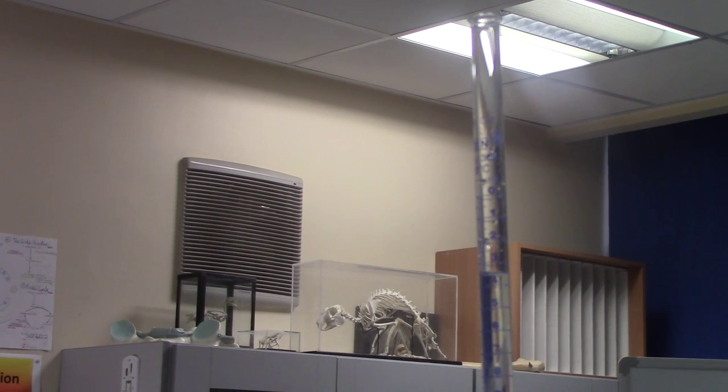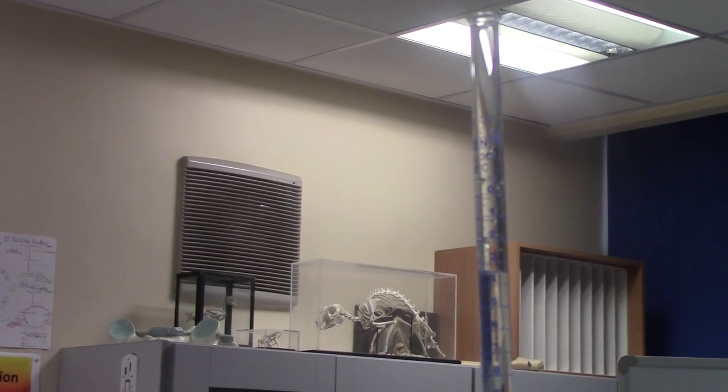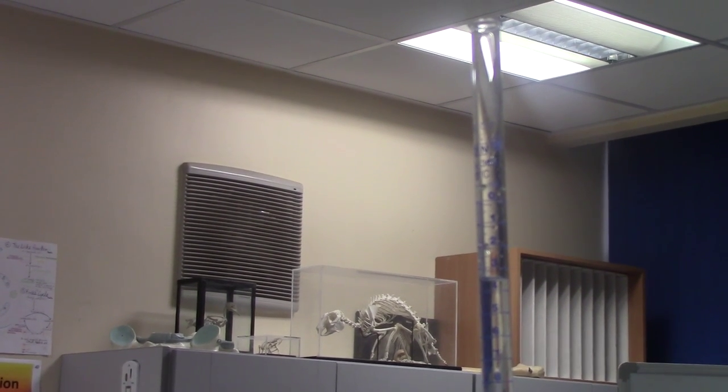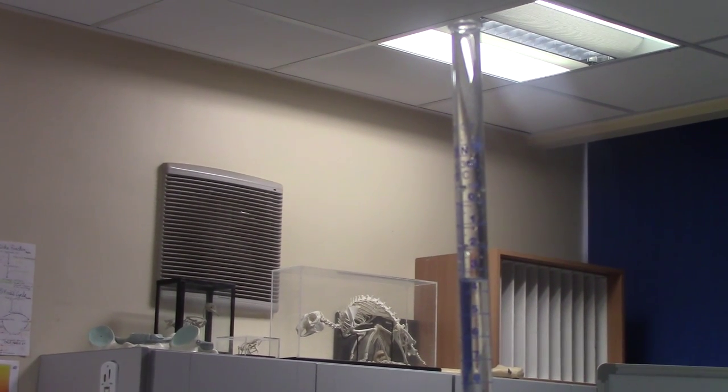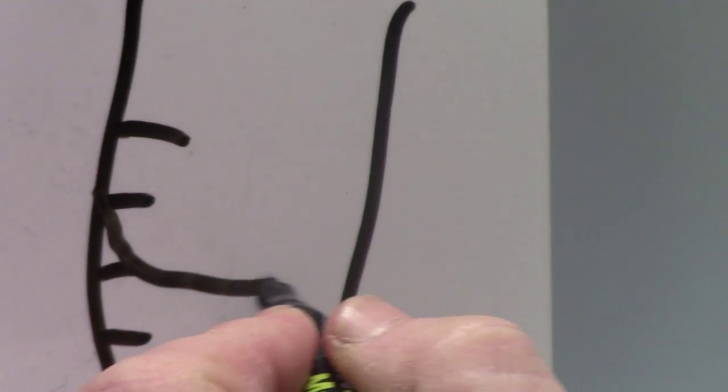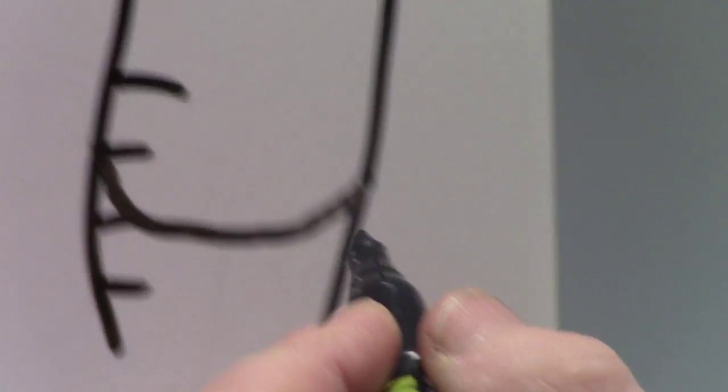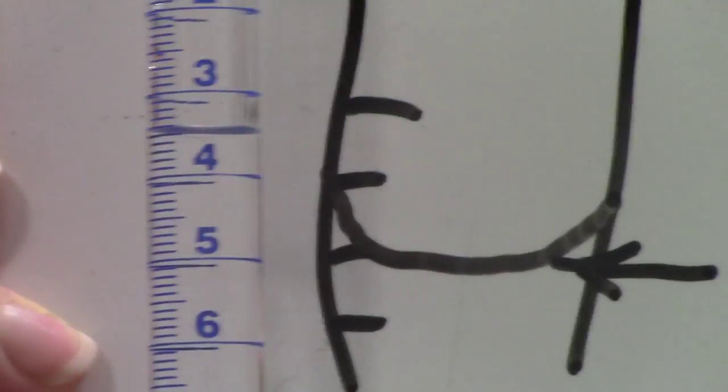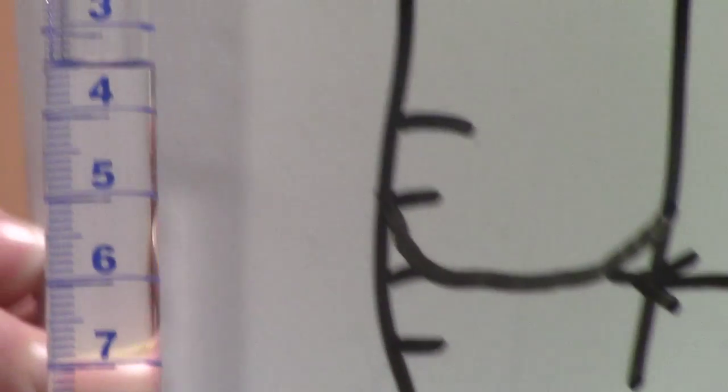Finally, I'm going to record my start volume. It's very important, if you look, you should be able to see that the titrant curves up at the edges of the glass tube. There's my scale and it's got this curve up. I need to record from the bottom of the meniscus there, so we record from the bottom of the meniscus in the glass tube.